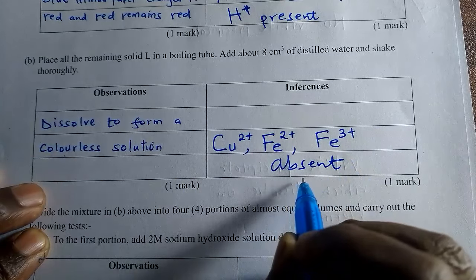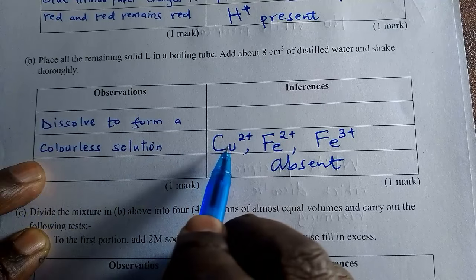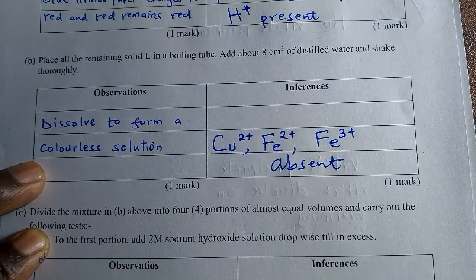Absent means that they are not there. If they were there, then the solution would be blue, green, and brown, right? Yes.